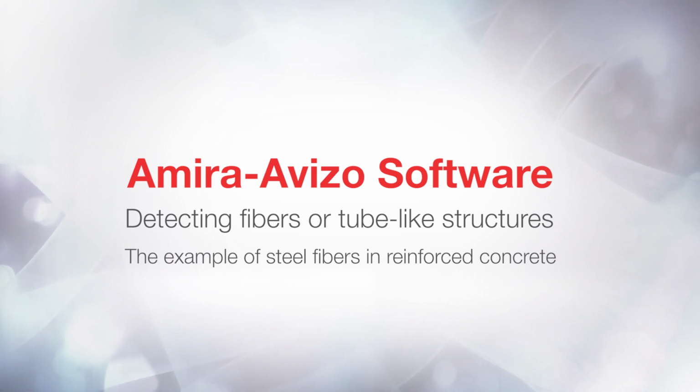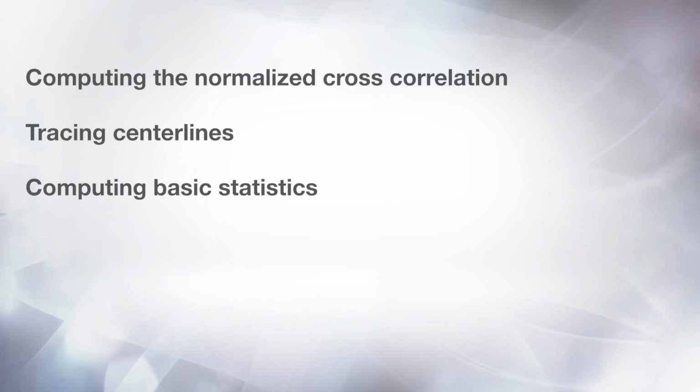The Avizo X Fiber extension provides specific support for tracing the centerline of fibers, filaments, or other fiber-like structures that have a relatively fixed and constant diameter. The method allows for robust and accurate centerline tracing of individual fibers, even in cases of noisy data or densely packed fibers, as long as the fibers are resolved with at least a few voxels for the diameter.